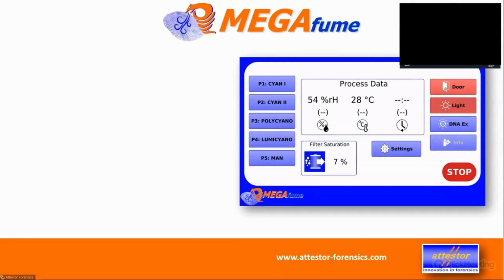This is why an experienced user or a supervisor can set up a cycle, and a cycle consists of various parameters, which you see in one of the next pictures, and then save that, and the public user can then just simply use the cabinet by using any of the buttons you see there on the left side.